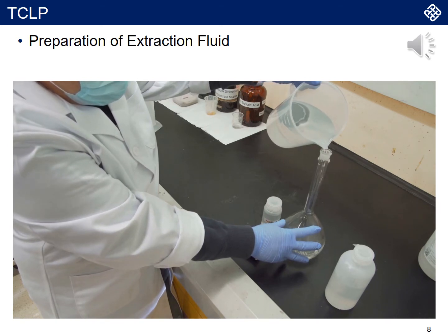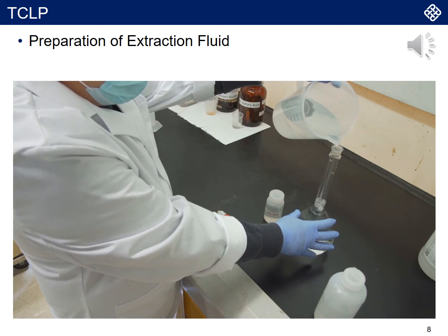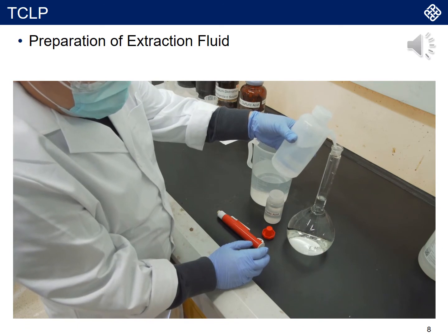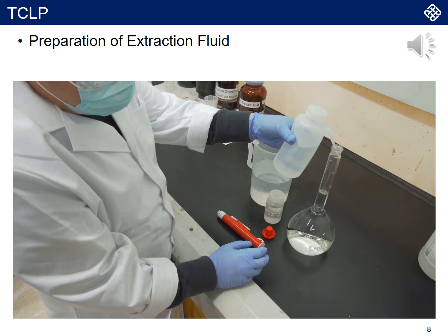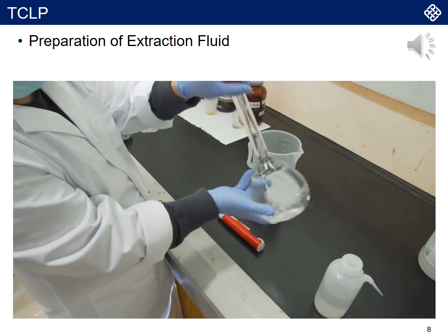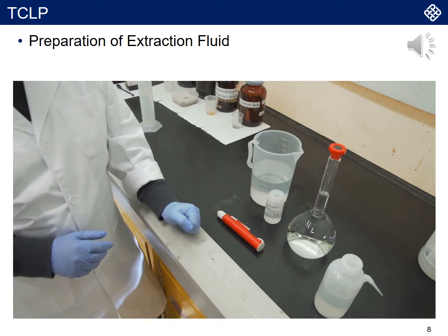So this is from the screen. You can easily see how it goes. And whenever you have added enough, you gradually stop. I'm not sure whether you have worked in a chemistry lab, but this is very typical for preparing this kind of sample. The whole bottle has a consistent bottom, so you just mix it well, and then you get the liquid.